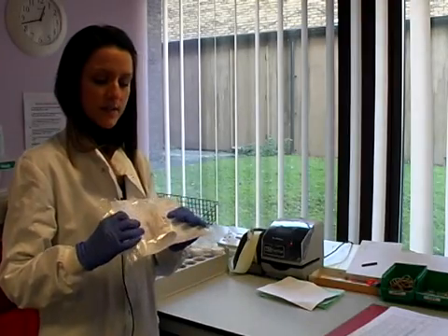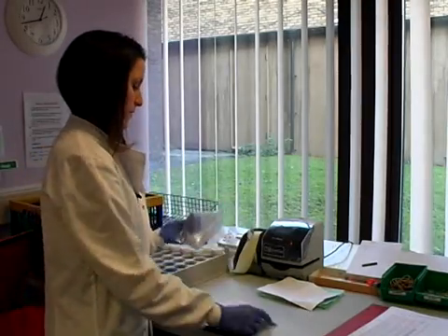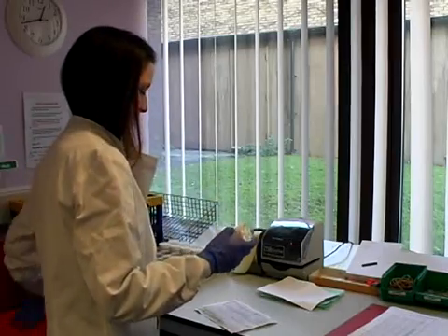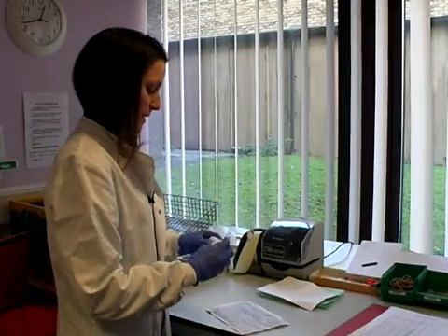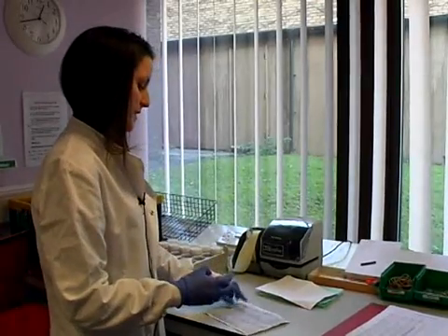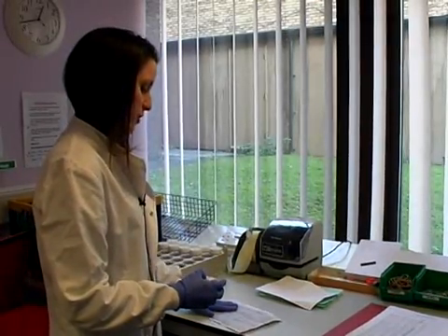We're in the sample reception where we receive our cervical smears in pots. They come with a form in a plastic bag. We take out the form and the pot, discard the bag, and then check to make sure that the patient's name and date of birth on the pot matches the name and date on our request forms.